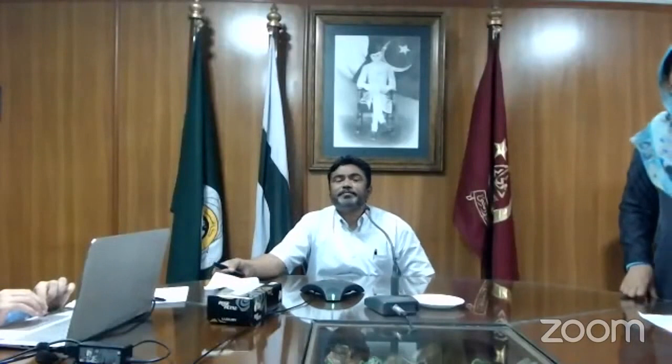There are some questions coming up. So can we interrupt? Sure. More interactive? There is a question from Gil Bibang, who asks whether we can quantify the components with just peak area. Yes, peak area. Okay.